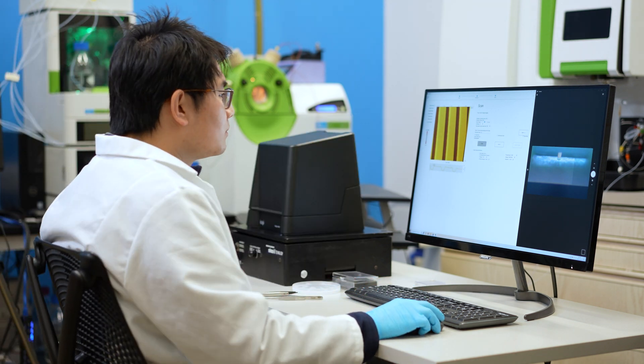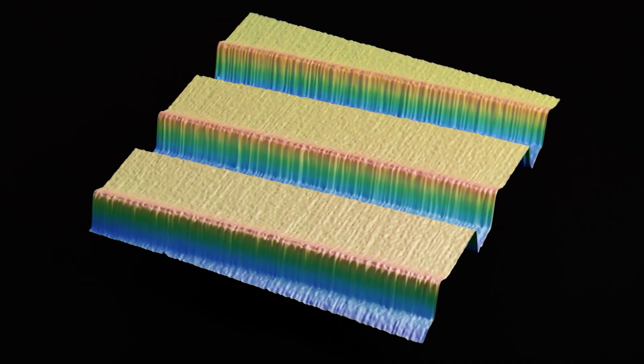And the scan's done. The time from sample loading to result, including setup, was 3 minutes.